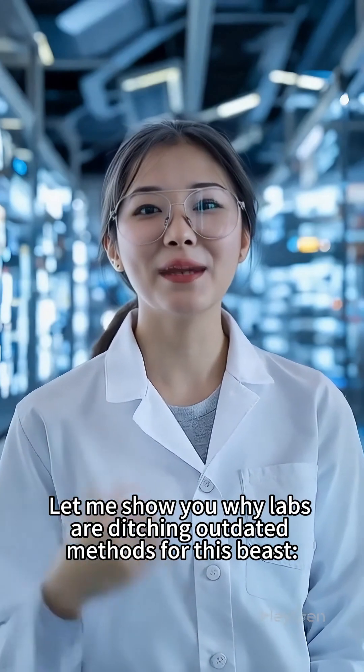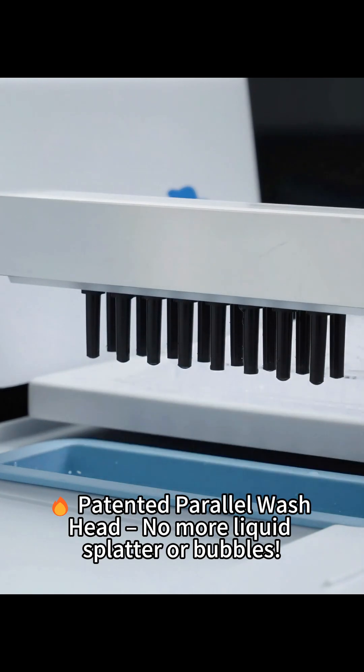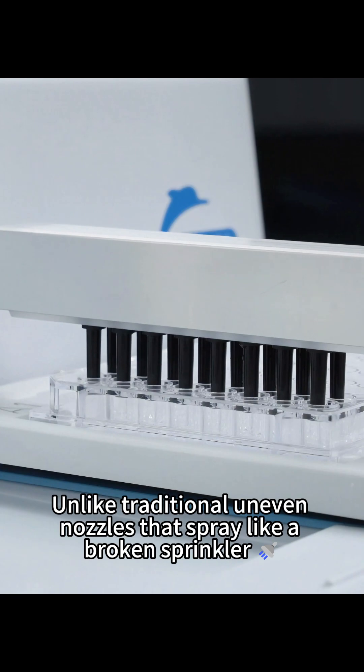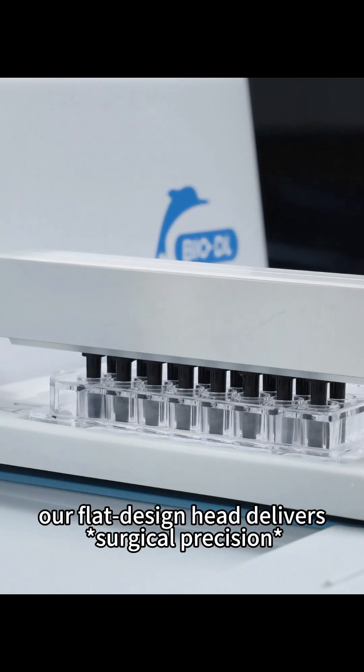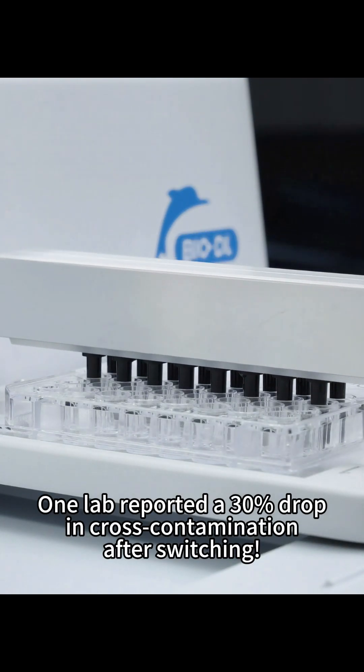Let me show you why labs are ditching outdated methods for this beast. Patented parallel wash head — no more liquid splatter or bubbles. Unlike traditional uneven nozzles that spray like a broken sprinkler, our flat design head delivers surgical precision. One lab reported a 30% drop in cross-contamination after switching.